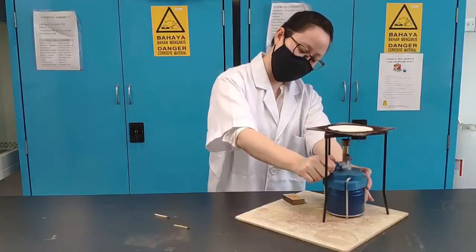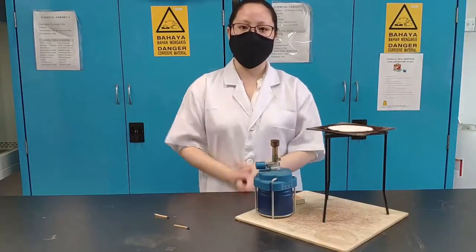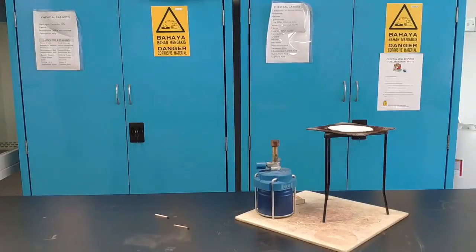To switch it off, simply turn the knob to switch off the gas. Turn it very tightly to make sure no gas escapes, as it is dangerous and flammable. And that's it — that's how you light a Bunsen burner.